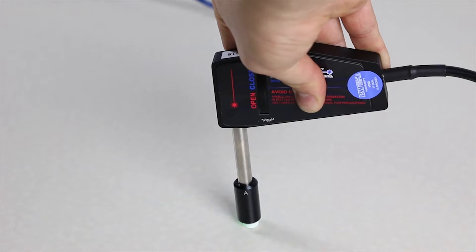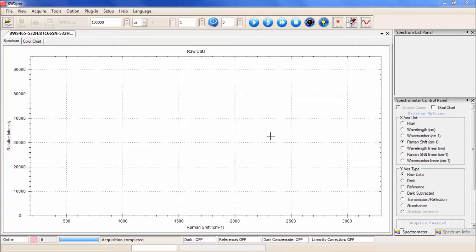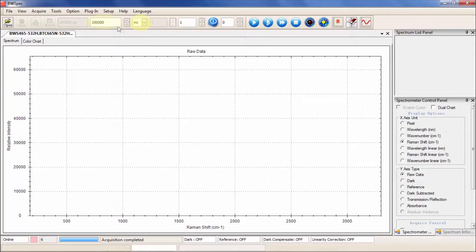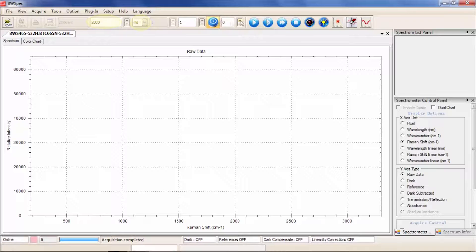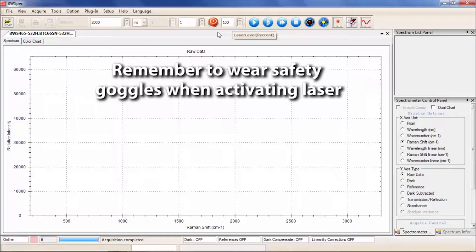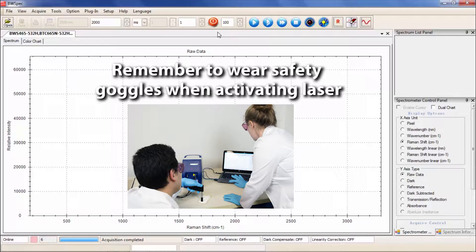On the software side, set your integration time to about 2,000 milliseconds for 532 laser and about 4,000 milliseconds for a 785 laser. Turn the laser on to 100% using the laser switch. For safety, we recommend wearing the laser goggles any time the laser is in use.